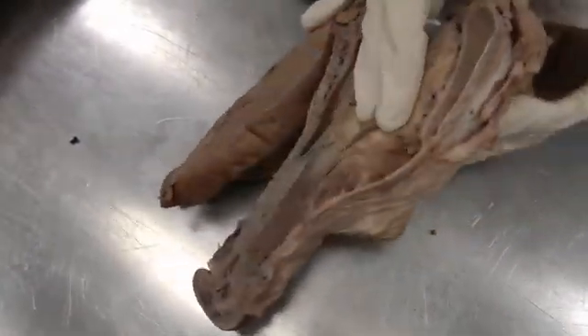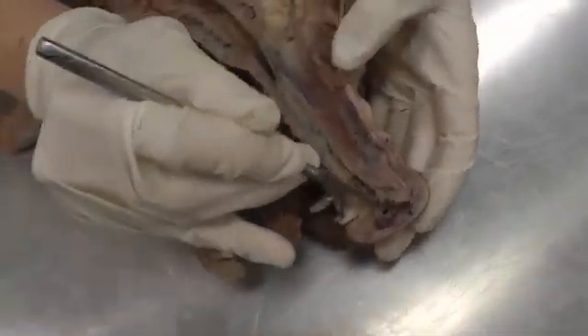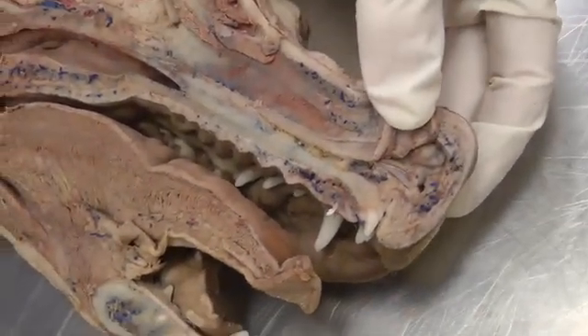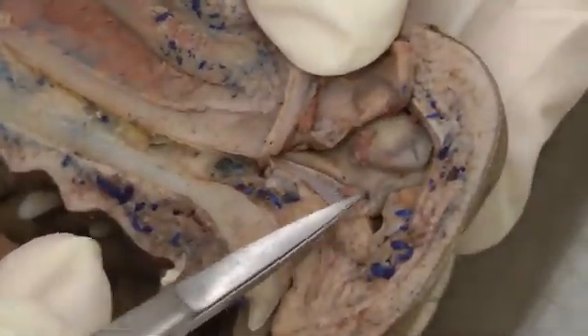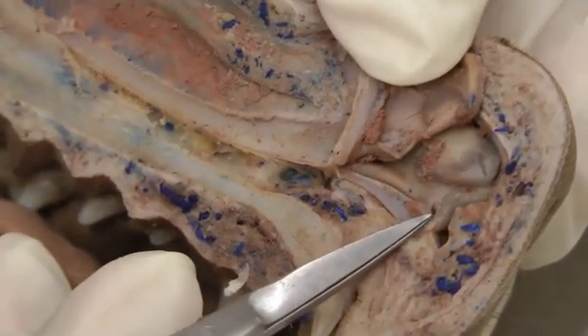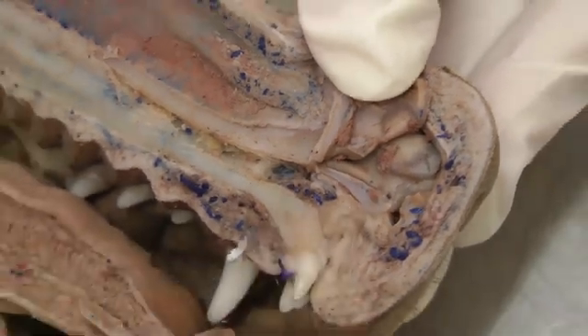I've cut a little window here so we can see — you won't actually see the nasolacrimal duct itself, but this tiny hole, with the scissors right in it, is the opening where the nasolacrimal duct dumps into the nose. Right at the tip of the scissors is that opening.